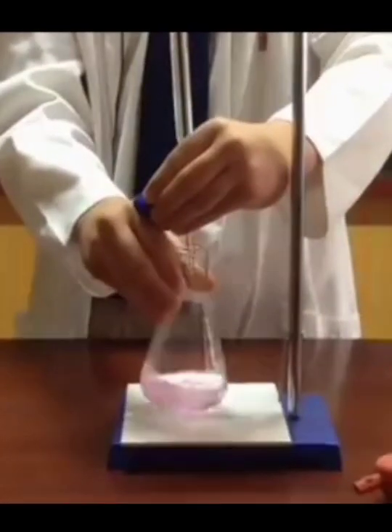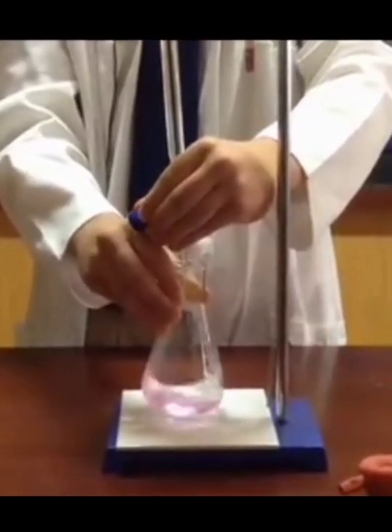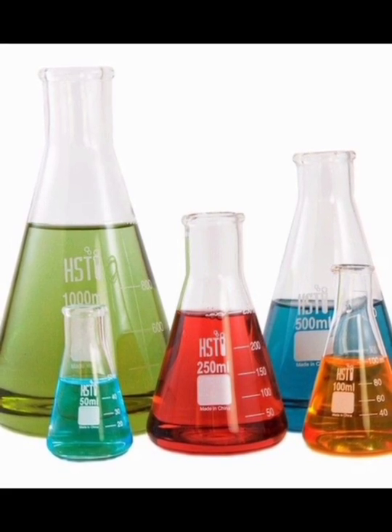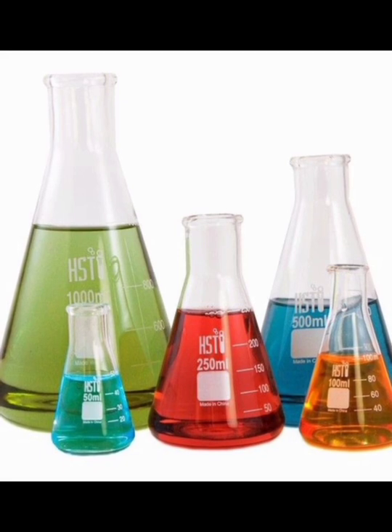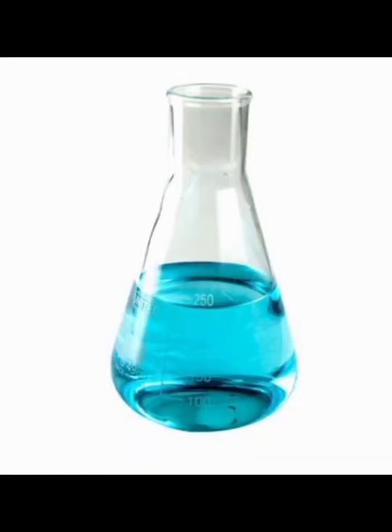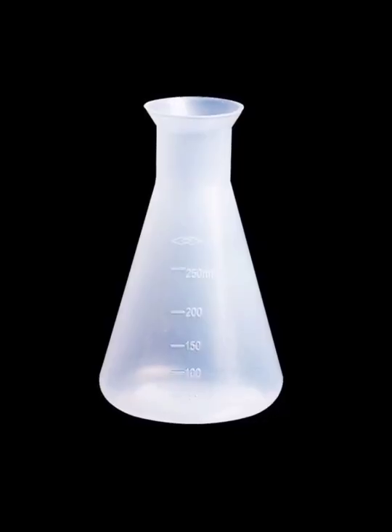The flat bottom avoids the risk of liquid going up the sides due to the whirling motion during titrations. It is available in different dimensions of 50 ml, 125 ml, 500 ml, etc. Depending on the application, they may be constructed from glass or plastic in a wide range of volumes.